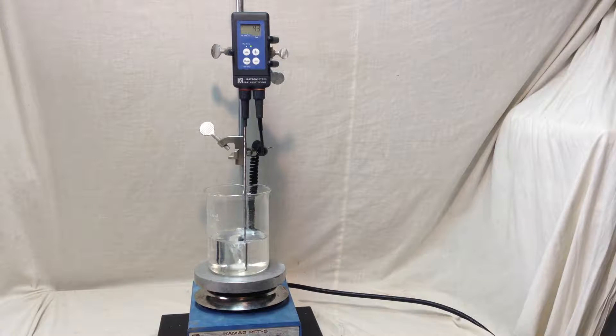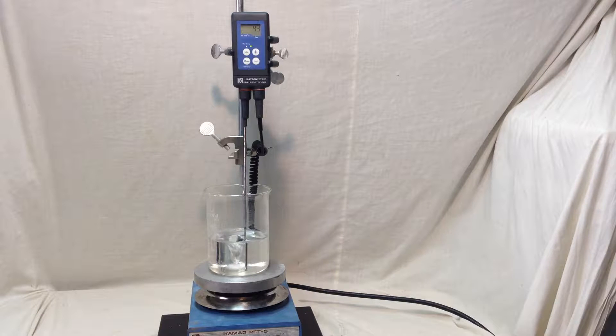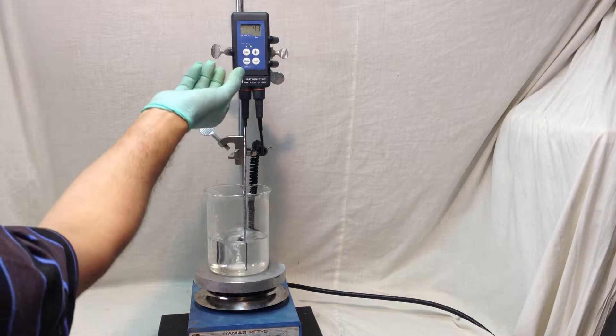Hello everyone, this is another hot plate made by Germany — the IKEA MAG RET-G hot plate plus IKEA Tron ETS-D3 temperature control sensor. It works properly — you can see the LED is off right now.